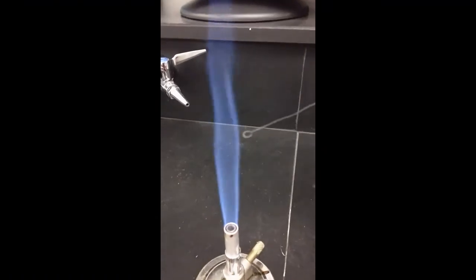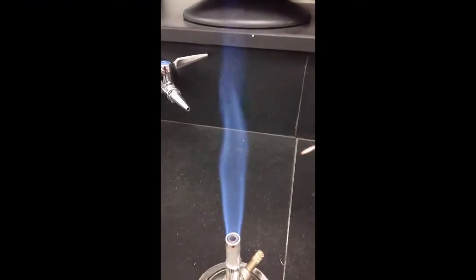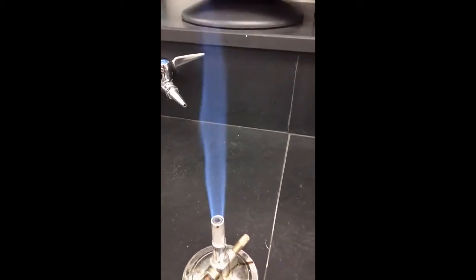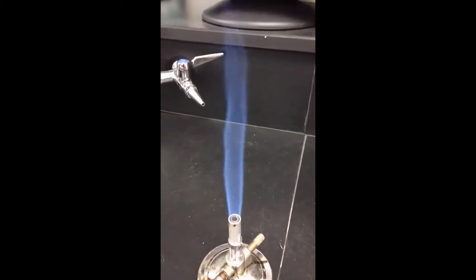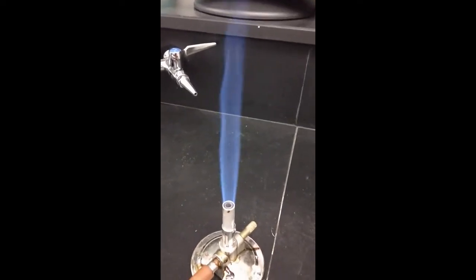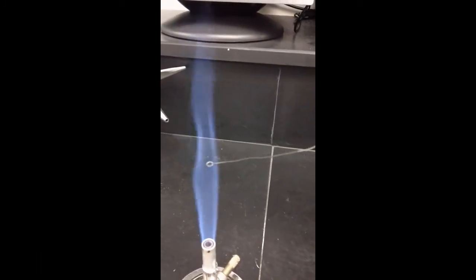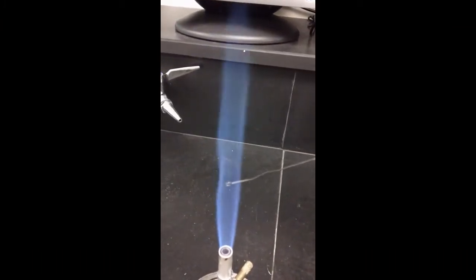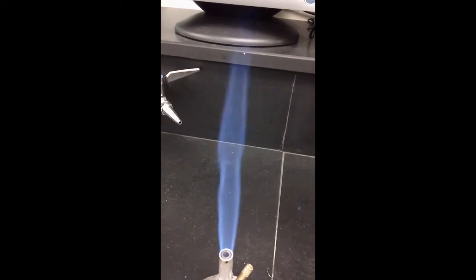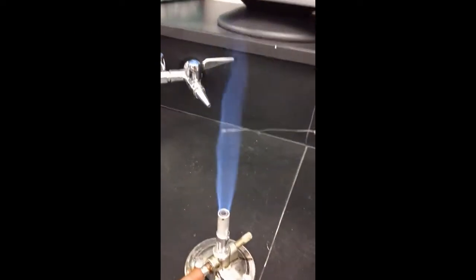It's not working out for me, is it? You see that? It was quick, so I'm gonna do it one more time. You wanna write down what you see. Again, this is test A, FE. Just see it? Super quick. Okay, I'm gonna make sure I clean my rod.